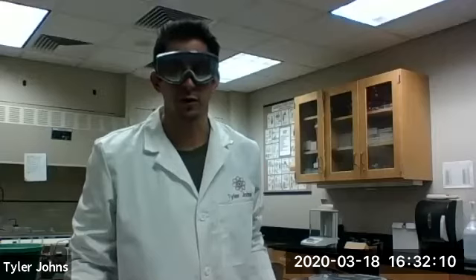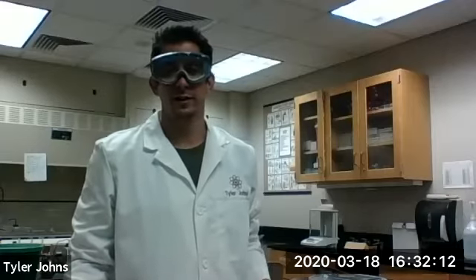Good afternoon, students. Today we are going to be analyzing the elements comprising the carbonate group, or group 4. Those elements are magnesium, calcium, and barium. So let's go ahead and get started.